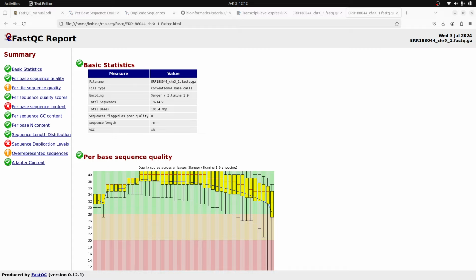Okay, so we see the report here. All right, so if you take a look at the report with FastQC, when you have your analysis done, all of them will be listed on the left side. We see them here, and then we have those that have the tick, the checked symbol, and they also have a color green, meaning everything is okay. There are those with an exclamation mark. That means something slightly unusual has been observed. And those ones will have this color, I think it's orange or so. And we also have those that have this X symbol, meaning there's danger. Okay, it's red. That means something unusual has happened.